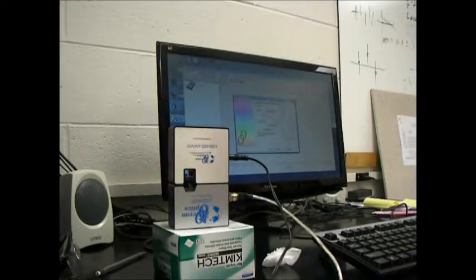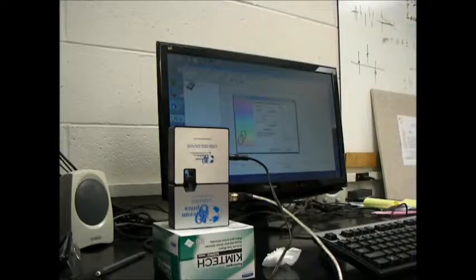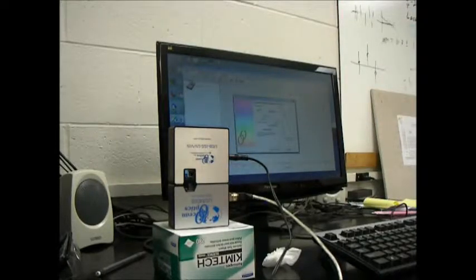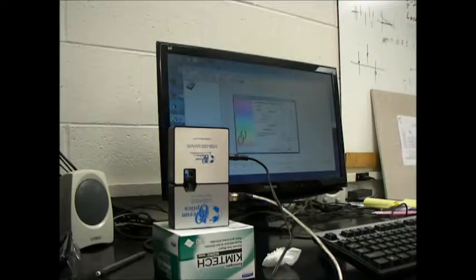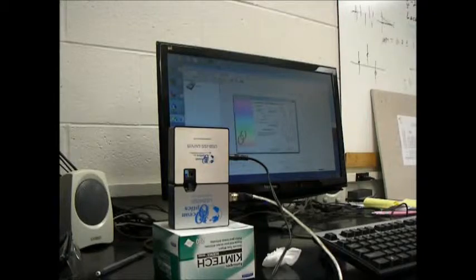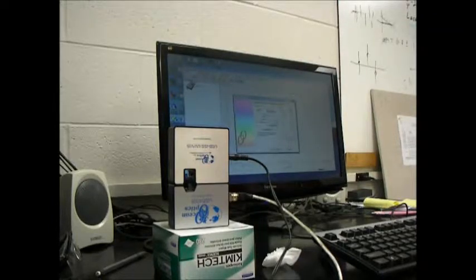Set the integration time to about 50 or 60. Set the averages to 10 and turn on the Strobe Enable. We've got a nice peak. I'm going to change it to 55.